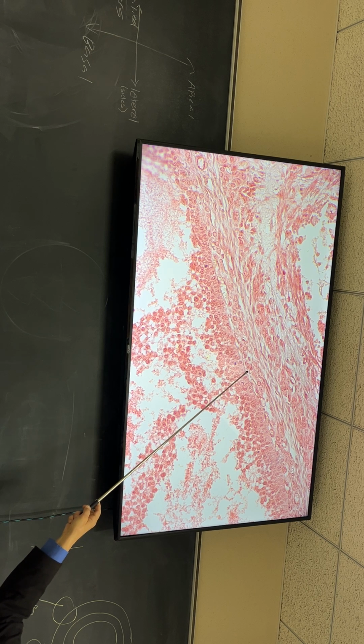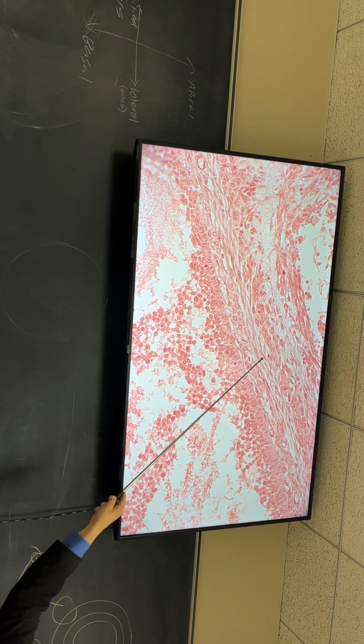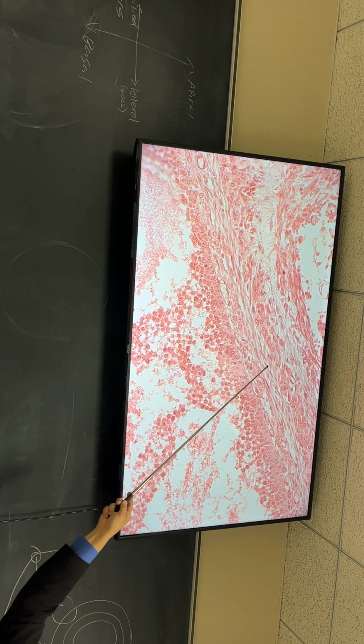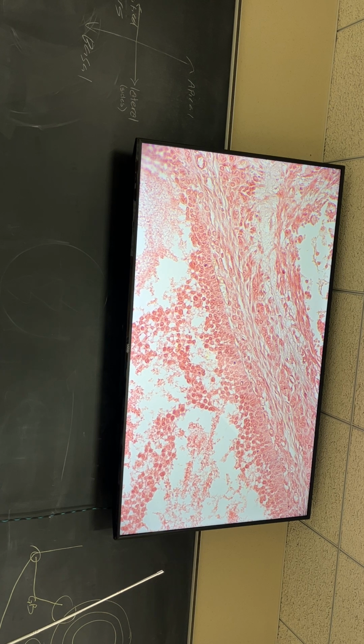But if you look here to about there, you can see that there's 2 layers, right? Everybody see the difference in 2 layers? You got this layer and that layer, right? Theca interna and theca externa, the 2 layers. Theca interna is this one, theca externa is that one, right? Just like many structures we have, it's got a 2-layer thing. Two protective layers around it.